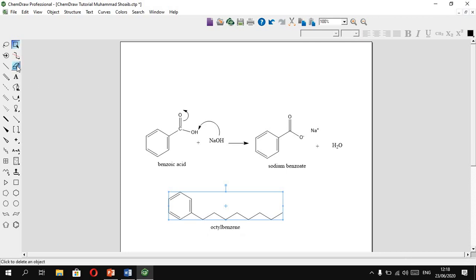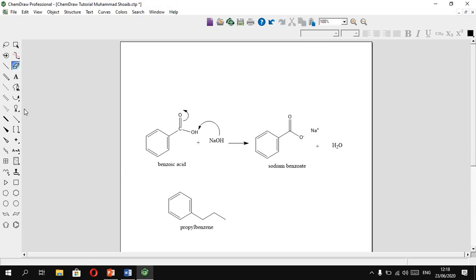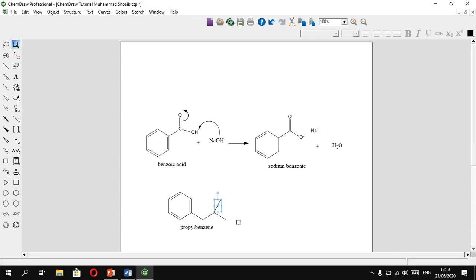It is very easy to use ChemDraw. Sometimes students bring a bond close to another carbon and it appears to be joined, but it is actually not connected. The red symbols indicate that the structure is incorrect, so watch out for this common mistake.